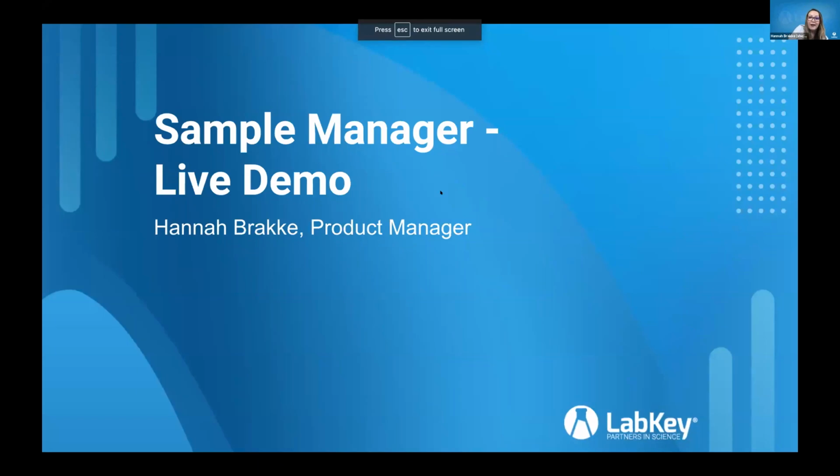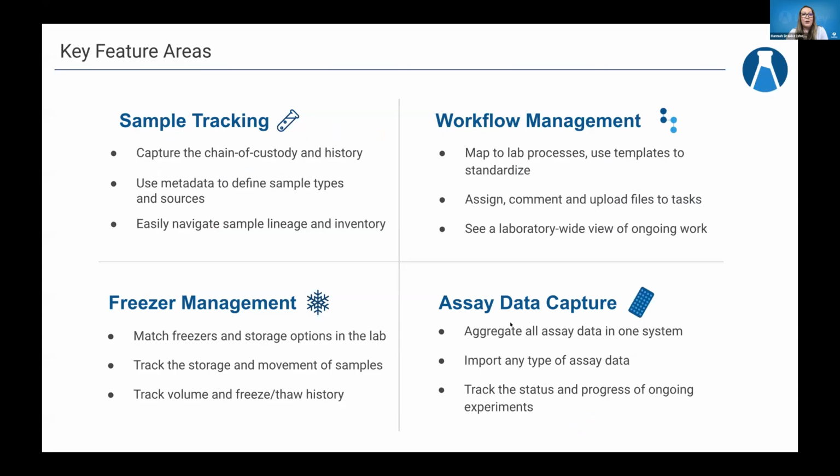So I'm going to be doing a live demo today. Again, please interrupt with questions as you have them. We'll just kind of go through the work that we're doing.